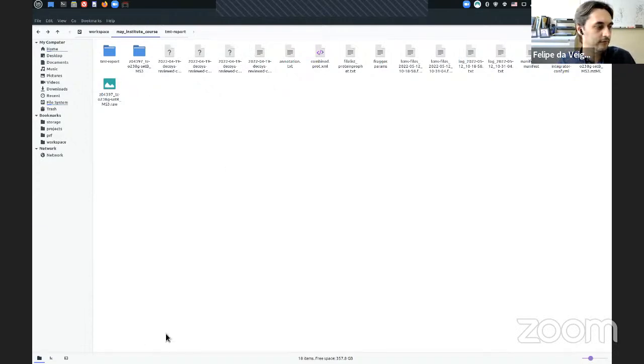If you still have questions, please take a look at our website again. Check if you can find the answer to your question there. If you have more questions about these tables and their formats, you can also look at the website. We have descriptions of them. If there is anything out of place or you're still confused, you can always open an issue. It doesn't need to be a bug report or anything like that. Some people just open issues to ask questions. That's fine, and then we can get in touch and help you.